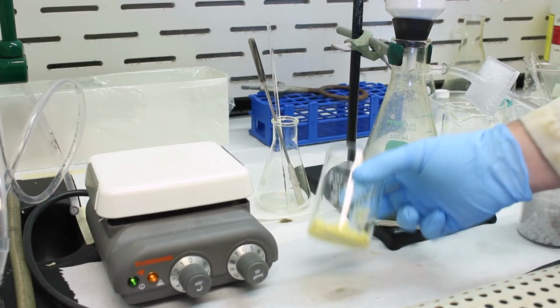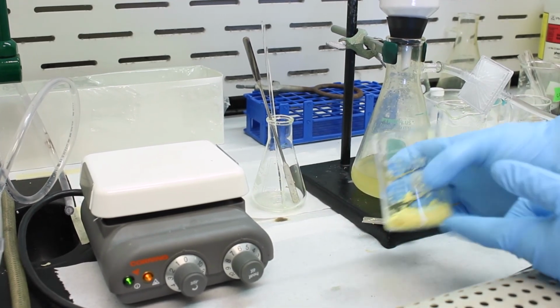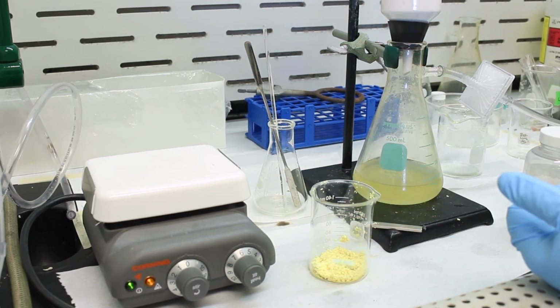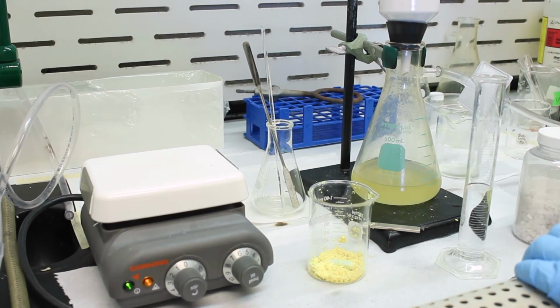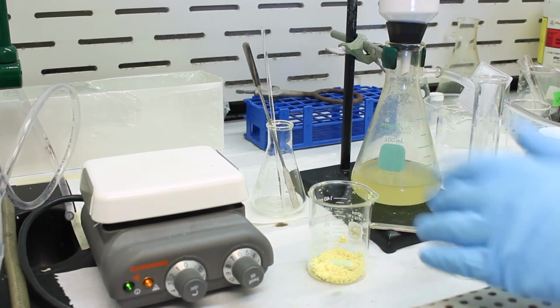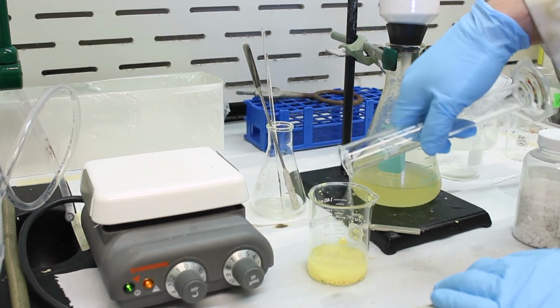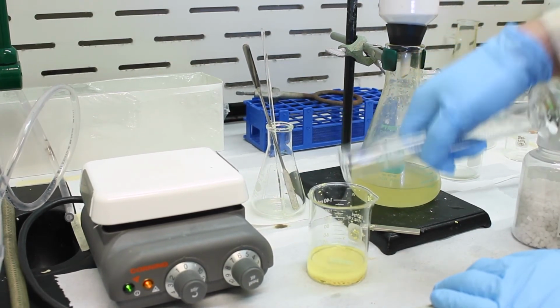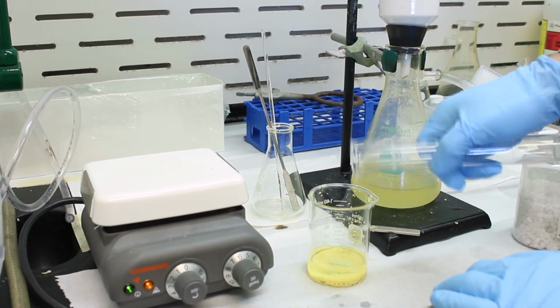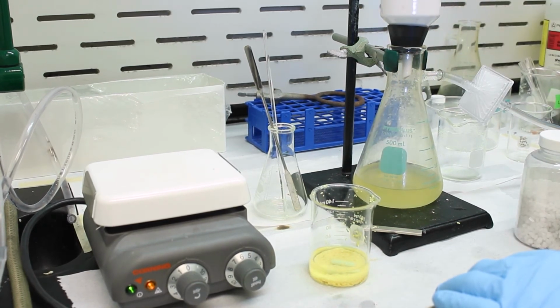Okay, so we have our crude product here. I've measured the mass on it, so we actually have a tared beaker here. I figured out that we have around 7 grams of crude. The rule of thumb that the literature says is to crystallize it from about 4 mL of ethanol per gram. So we have around 7 grams, so this is about 28 mL of ethanol, 95% ethanol. So it's going in here. Okay, and the goal is we're going to heat it up until everything dissolves, and then we're going to cool it, or take it off the hot plate to let it cool and hopefully crystals form.